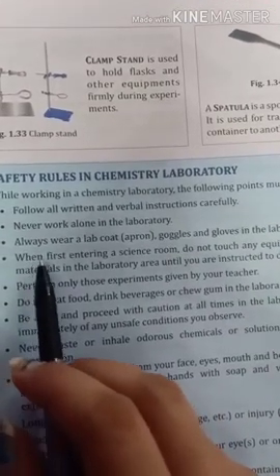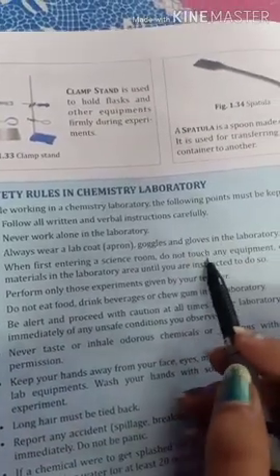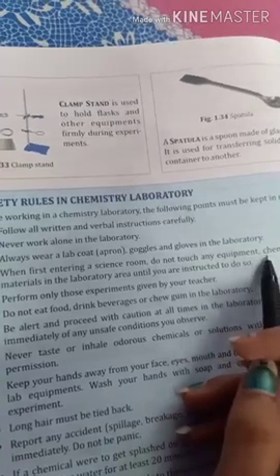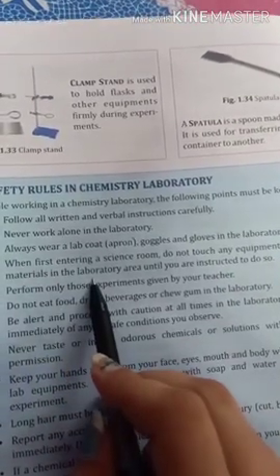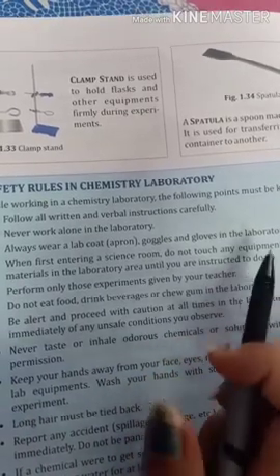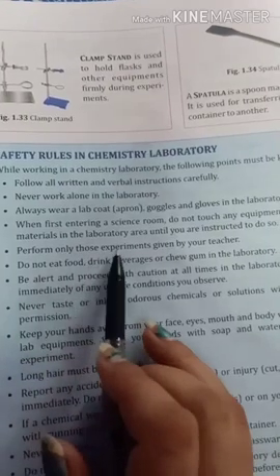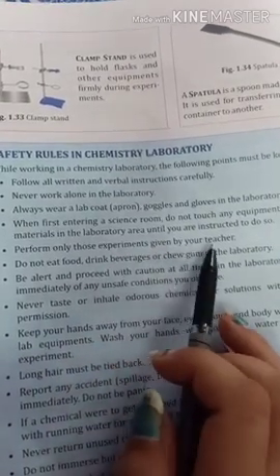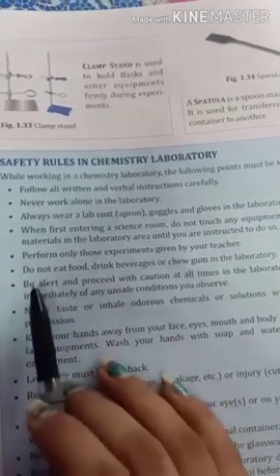Next, when first entering a science room, do not touch any equipment, chemicals or materials in the laboratory area until you are instructed to do so. Perform only those experiments given by your teacher. Don't do anything by yourself.